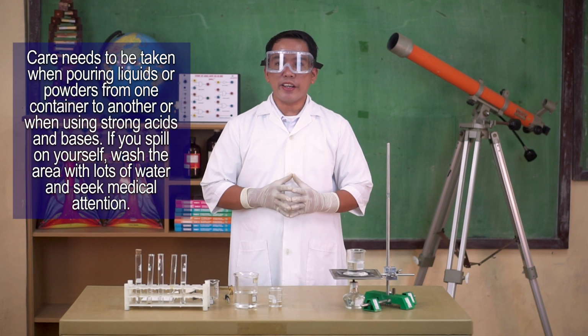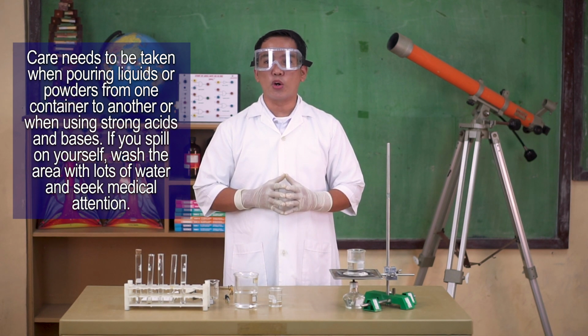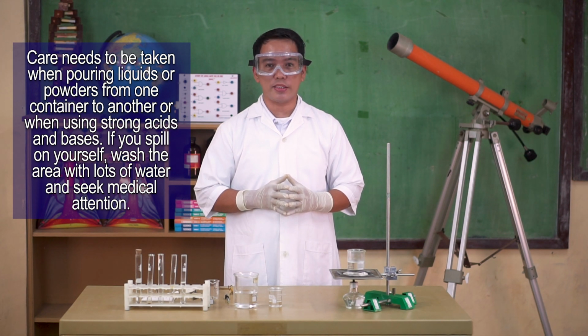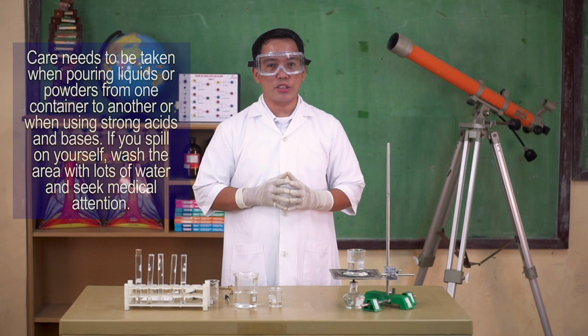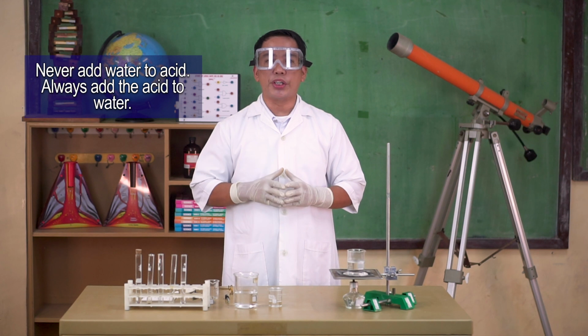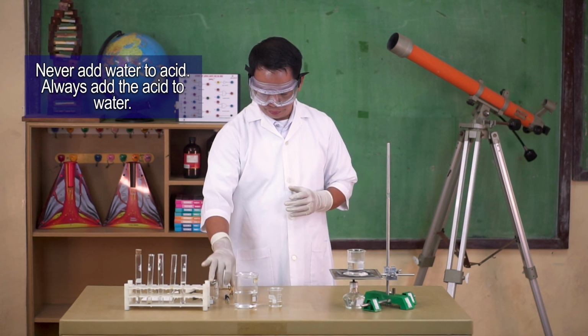Care needs to be taken when pouring liquids or powders from one container to another or when using strong acids and bases. If you spill on your skin, wash the area with lots of water and seek medical attention. Never add water to acid. Always add the acid to water.